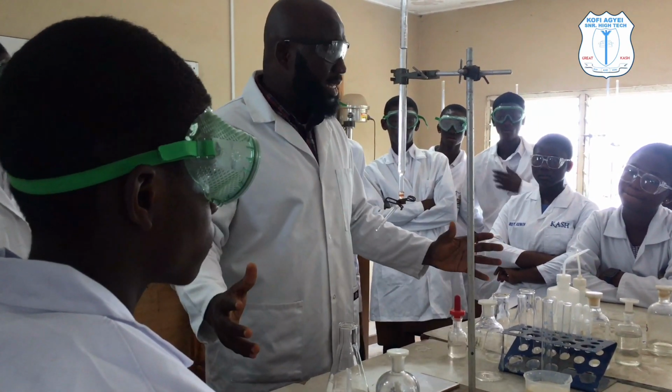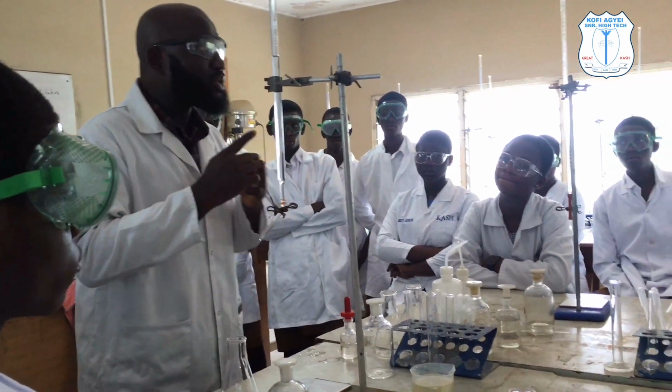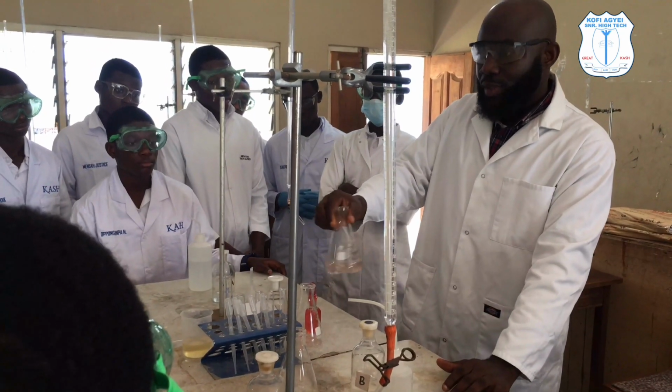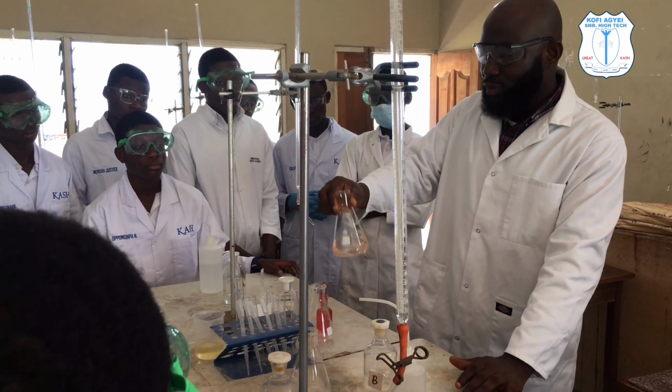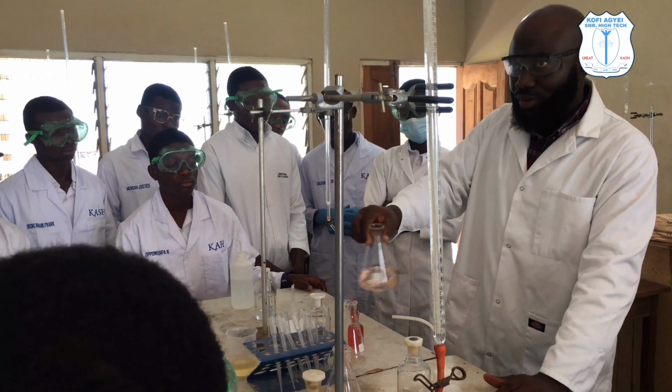I believe you've seen the color changes. The methyl orange will give us a different color. The phenolphthalein will also give us a different color. Now, what happens when you swirl? You are trying to speed up the rate of the chemical reaction. You get it? You have to swirl.